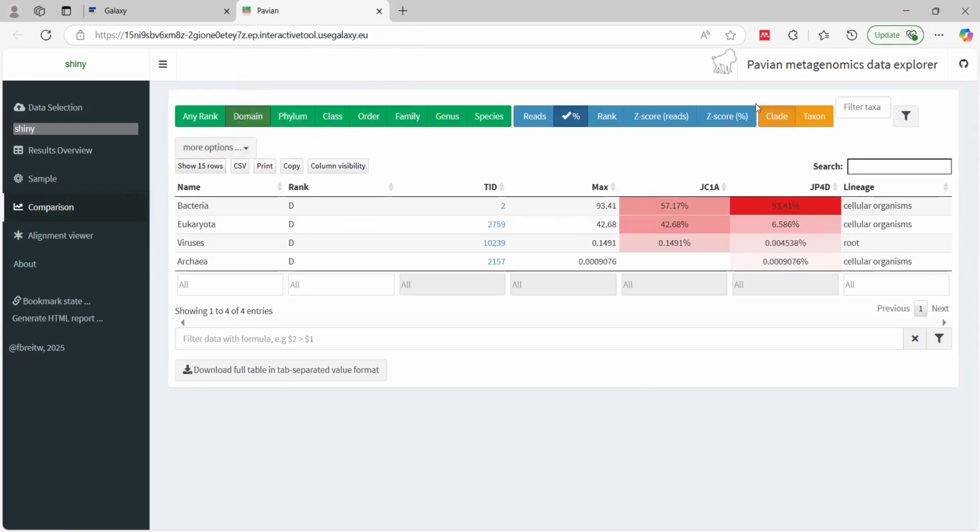First, I need you to remember that the first sample is from the unfertilized pond, the pond we have never intervened in, the control pond, and the other sample is from the pond that we have added nutrients to, we have fertilized this pond, okay?